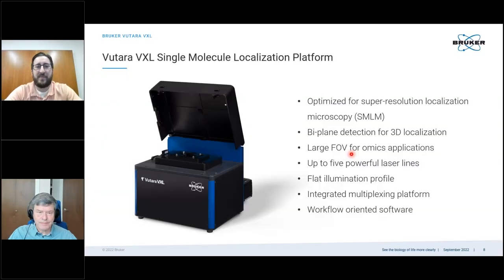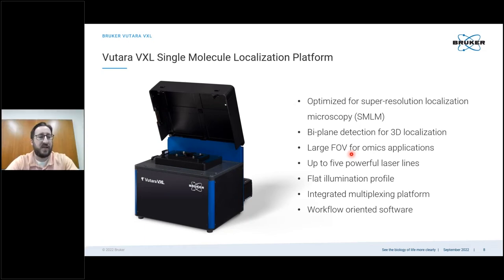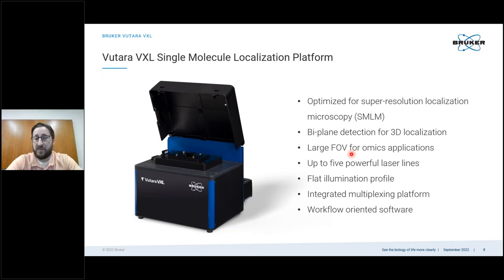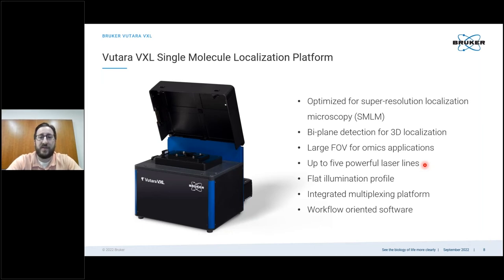I'm happy to be here today to talk about the technical side and some of the design considerations underlying the Vutara VXL microscope. The Vutara VXL is an optical benchtop microscope optimized for single molecule localization. It utilizes our biplane detection methodology for accurate three-dimensional localizations even with a single objective Z position. We also provide a larger field of view for omics applications, up to five powerful laser lines for illumination, a flat illumination profile, an integrated multiplexing platform, and workflow-oriented software to facilitate ease of use.